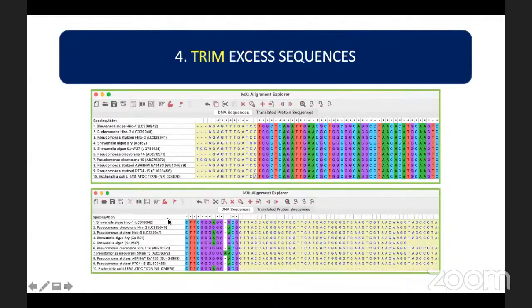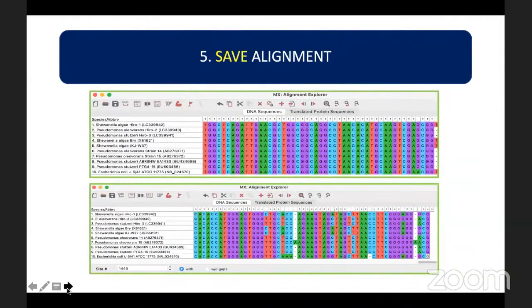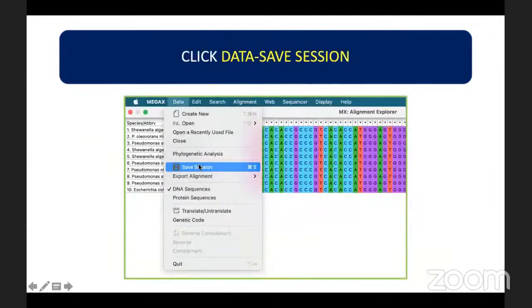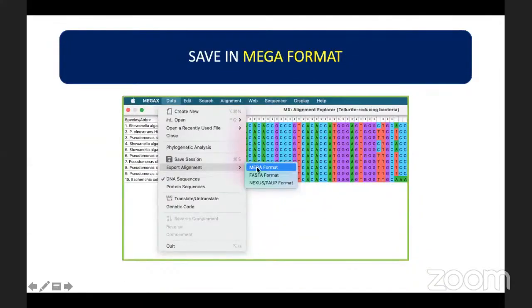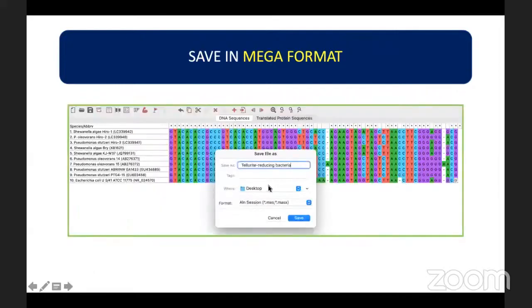To trim the excess sequences, highlight those unaligned excess bases and use the scissor icon or the X icon to delete them. The fifth step is to save the alignment. To do this, click Data, Save Session, and save the alignment in MEGA format. Type the name of the file for alignment and click Save.